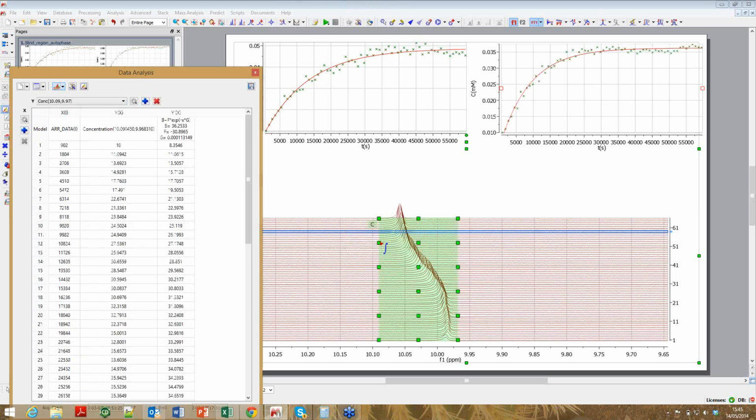So those are roughly equivalent. You could argue that there's probably a little bit more noise in the data points. So yes, the GSD may not give you quite as accurate an integral as the sum integrals, but it can be applied in cases where sum would clearly fail. So I apologize that this isn't a brilliant example of it, but I'm sure you can think of cases where that would be a problem.